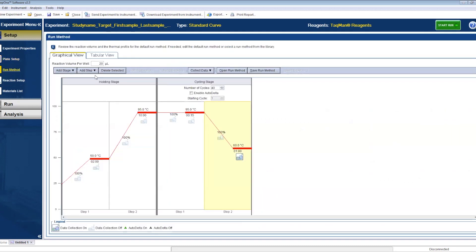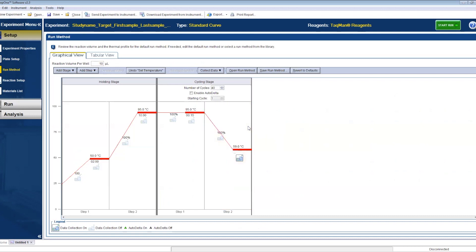Once you're finished, go to run method, change the volume of the reaction to 10 microliters - that's the lowest the software can go even though we're running 7 microliter reactions - and the temperature at the cycling stage to 59 celsius.